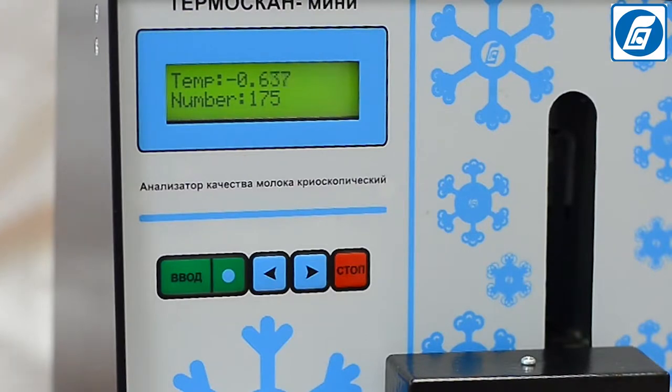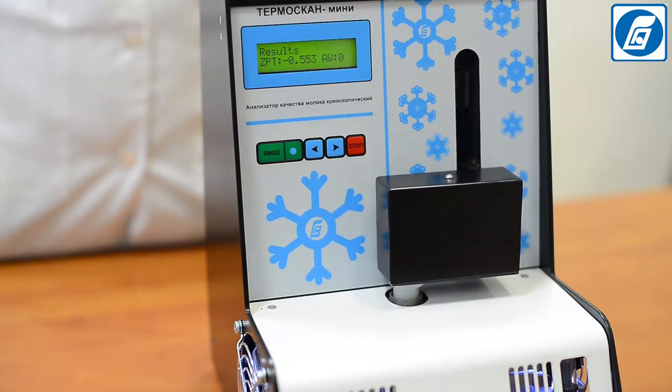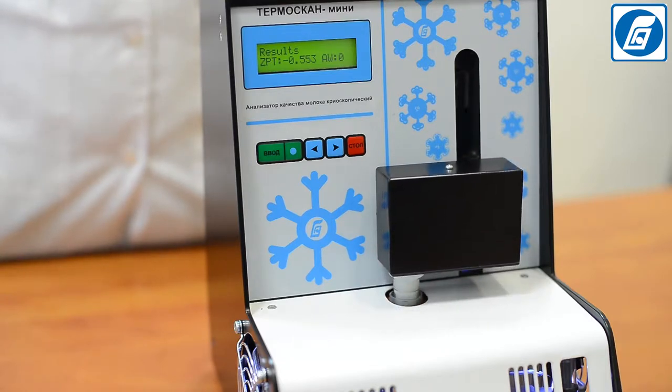Determination of the freezing point of milk is the main method for detection of dilution of milk with water — the most widespread way of milk adulteration. After completing the measurement, the percentage of added water and the freezing point are shown on the display.